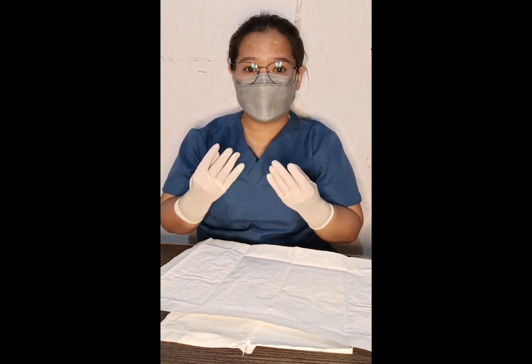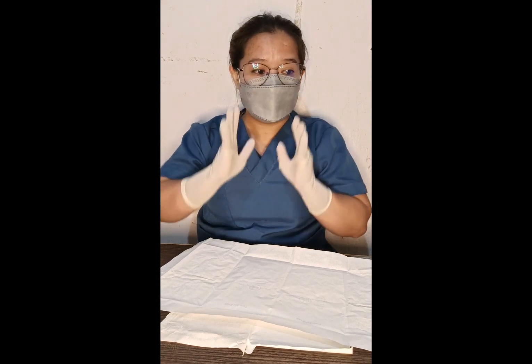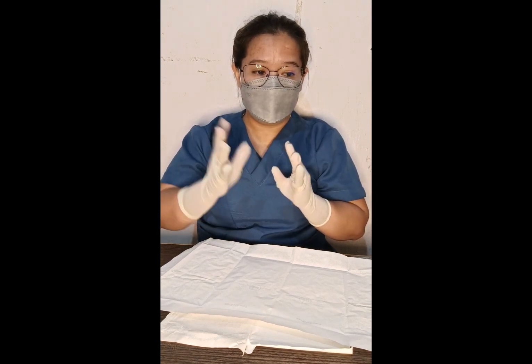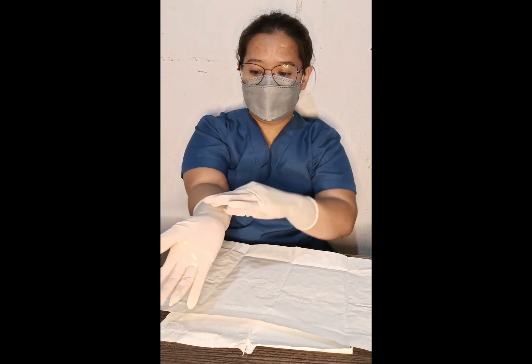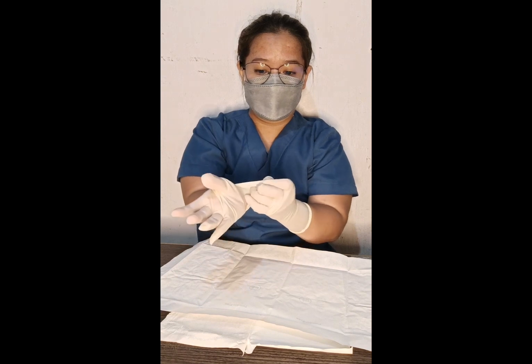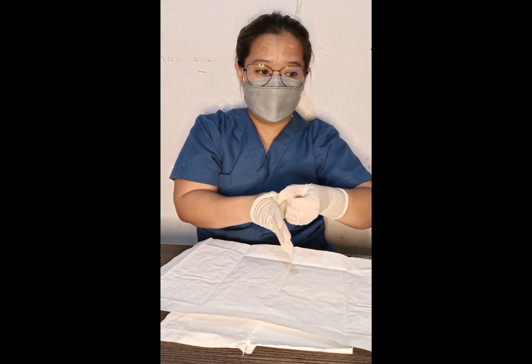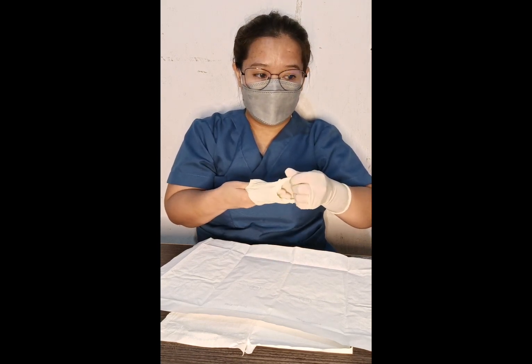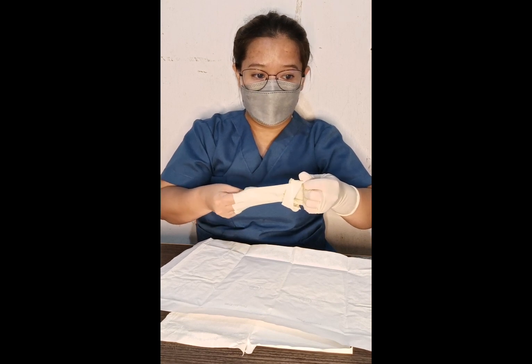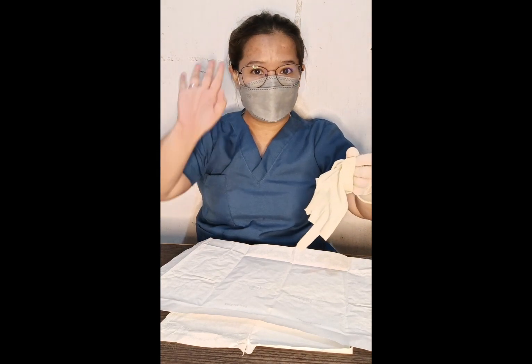So assuming that these gloves are already soiled and have been used, we will be removing the gloves. First, we need to brush the palm against the other side. We will pinch this one, and then pull the glove off by turning it inside out. Hold the glove in the palm of your still-gloved hand. Slip two fingers in. Alright, so this one has already been removed.